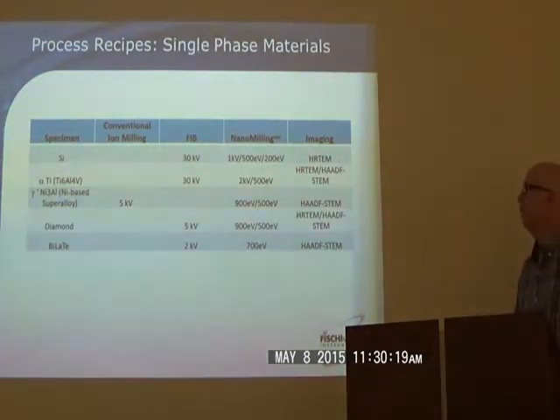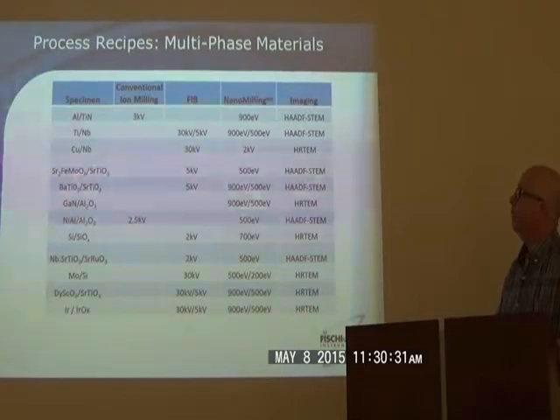As far as the full recipes, we have a good knowledge of what parameters to use. Again, the times, they vary, it depends on the initial thickness that we have, but we have data like this, next slide also, for metals, for ceramics, for layers on other ceramics, all this kind of information is available. Next slide.